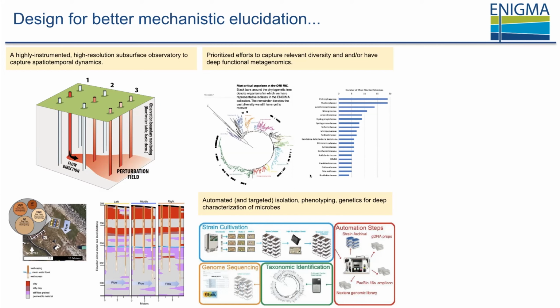And then it turns out that we have a fair number of them, so we prioritize these by their importance, that is how abundant they are, how active they are by things like BONCAT, and whether or not they correlate with biogeochemical processes that we observe in the field. And so we need a way of turning this data into these trees, relate those to the individual isolates that we have, and then to score the isolates by how important they are for the biogeochemical processes we're observing in the field. That's the workflow we're trying to put together here.